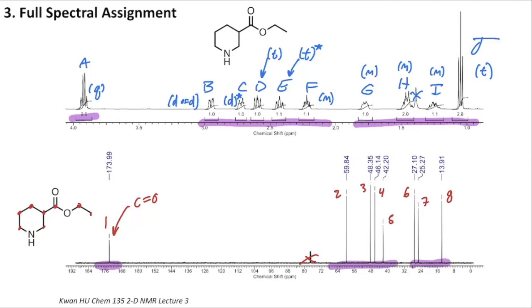But it may not necessarily be as clear a distinction or quite as cut and dried as it seems to be for the proton. That's where we'll make good use of our HSQC data. When we get a little more information from the COSY about the protons and start putting in some preliminary proton assignments, we can then use the HSQC to start thinking about which carbons go where and see if their chemical shift ranges make sense for their locations.